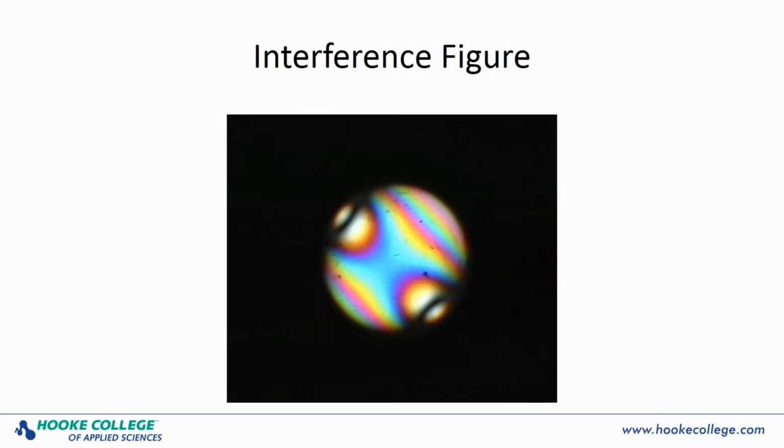When interpreted properly, a tremendous amount of information about the sample can be obtained, leading to complete characterization or final identification. This technique is particularly useful for analyzing samples that are relatively large and flat, such as polymer films, certain mineral grains like calcite or mica, and explosive residues like ammonium nitrate.